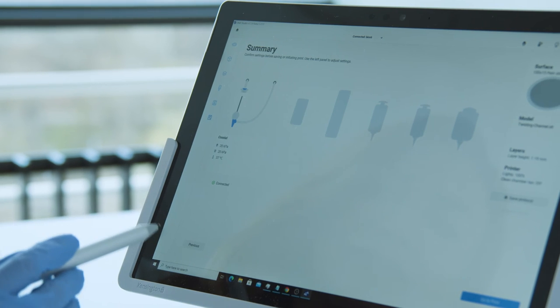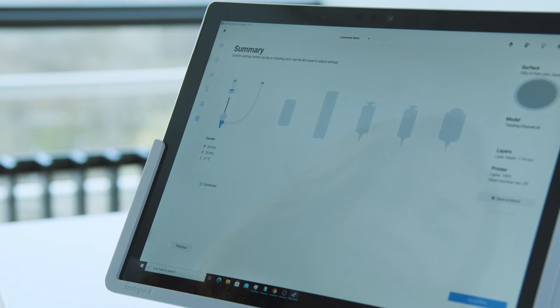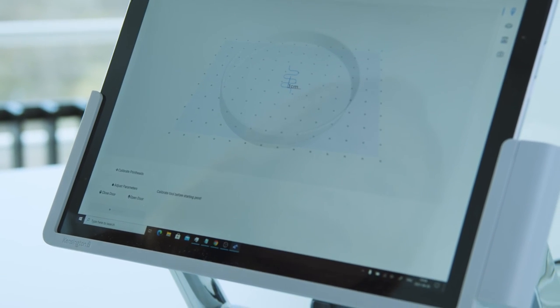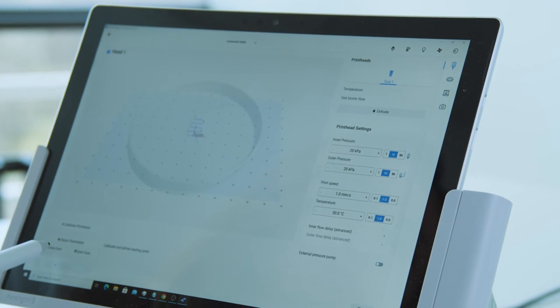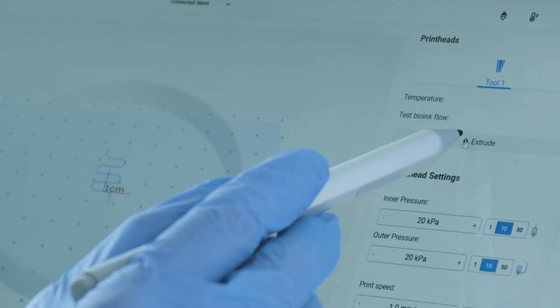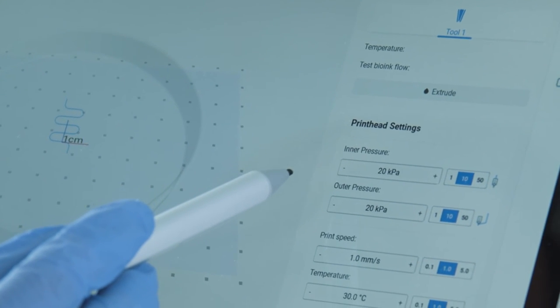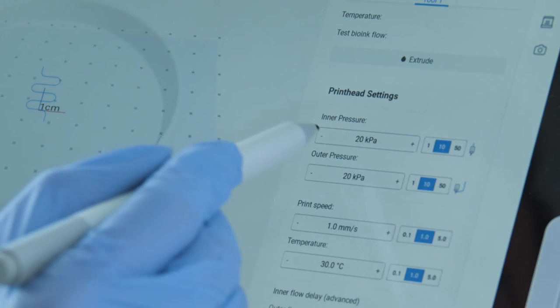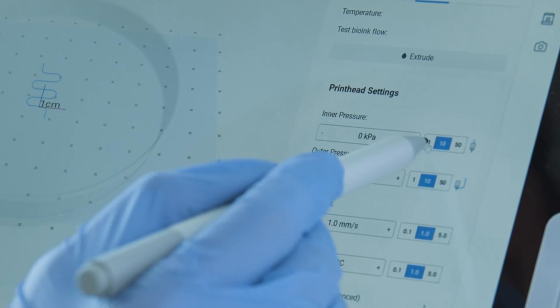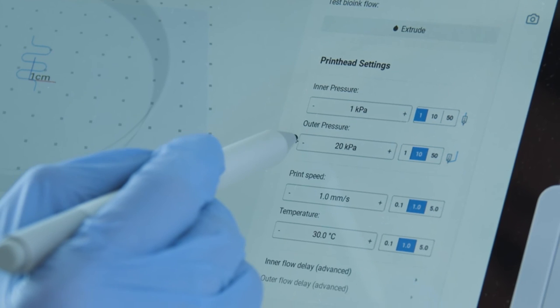Here you can see the summary of the printing settings. Press go to print. From the right panel you can test the extrusion before starting to print, and make sure that the inner and outer extruded bioinks are visible and concentric. You can use this panel to adjust the printing settings further, even during the bioprinting process, to improve the resolution.